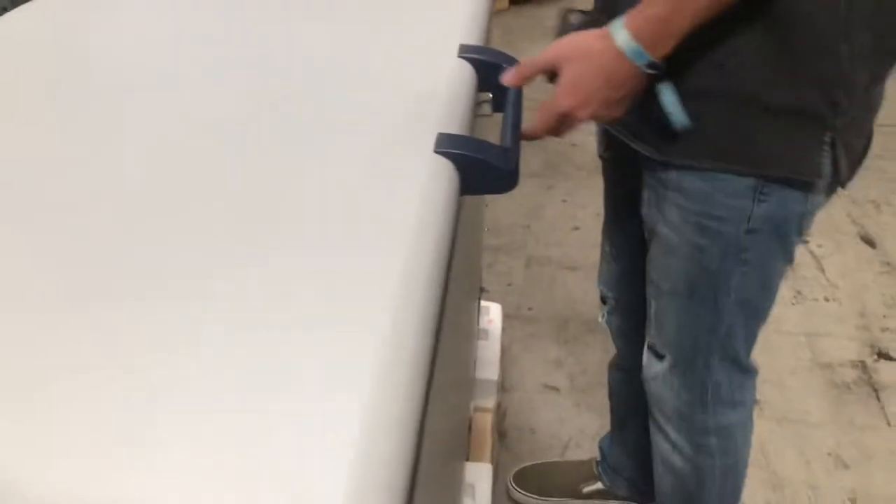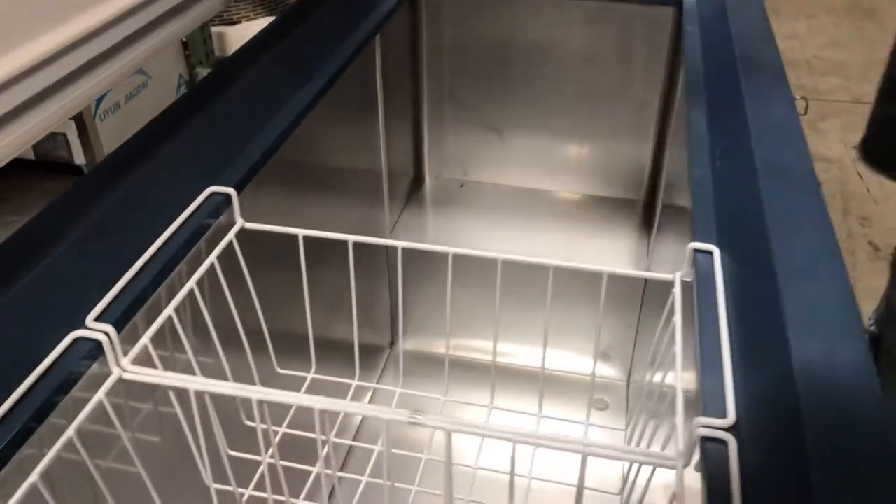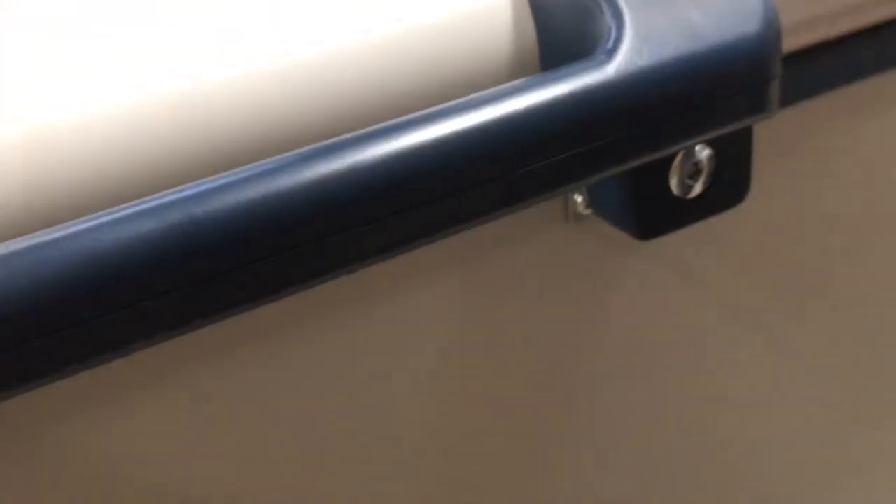This unit has a handle here in the front and also has handles on the sides. It comes with two baskets and also comes with some keys. You can lock this unit — it has a little lock over here in the front, so you have the keys right here to lock it. It has the two baskets.